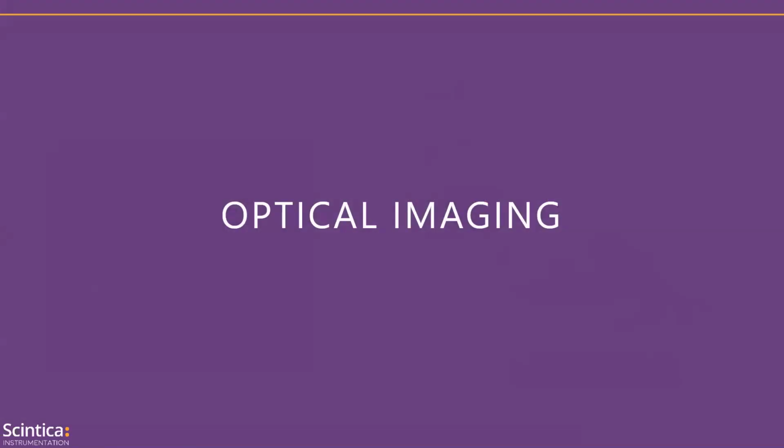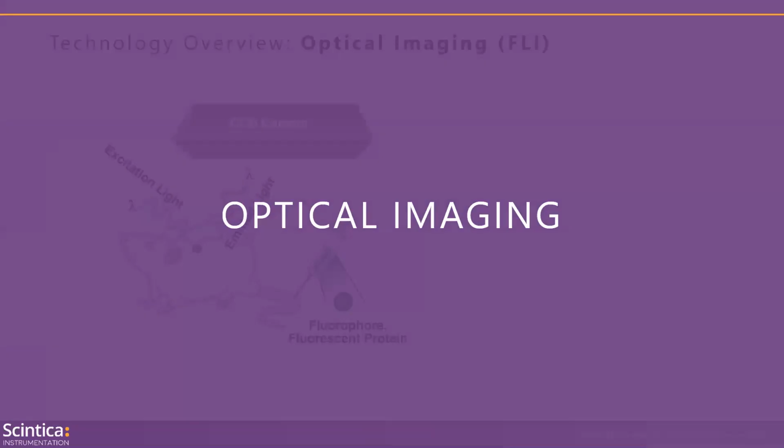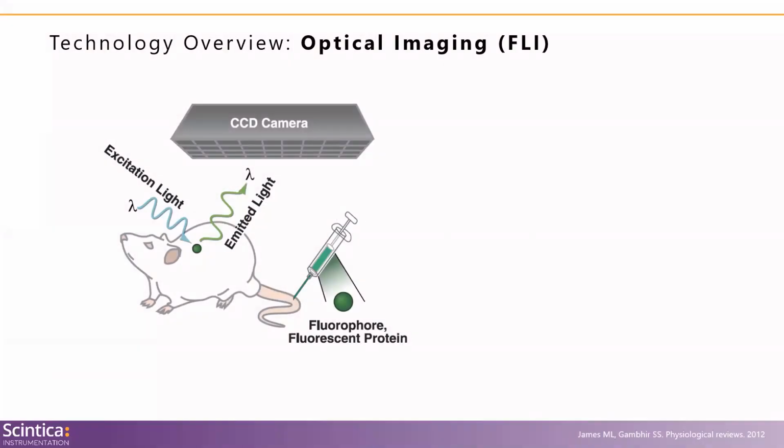Okay, jumping into optical imaging. Now for optical imaging, as I mentioned, I'm going to go over both fluorescence and bioluminescence imaging. They are quite similar, but there's some very important differences that I would like to cover. So we'll start with fluorescence.